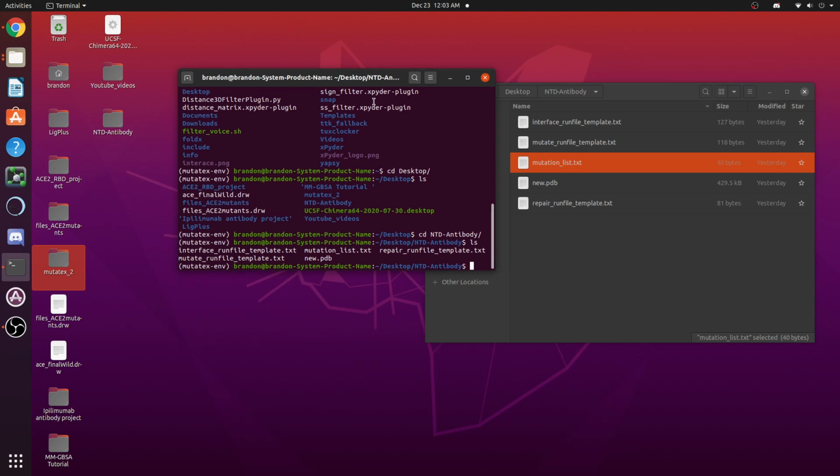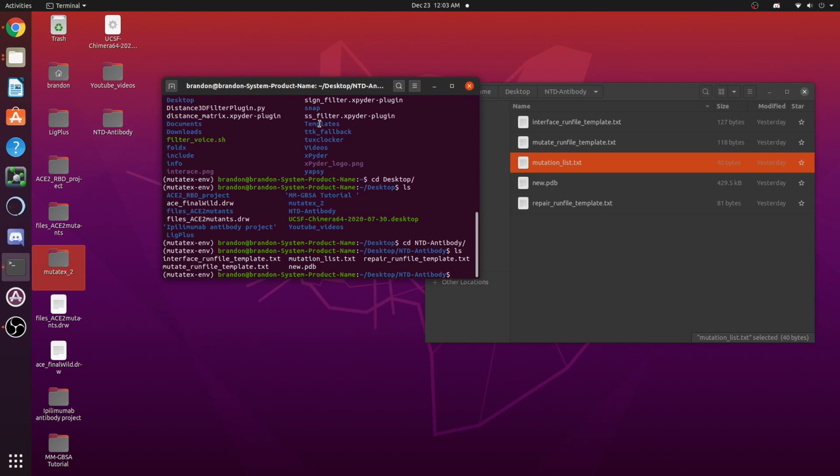So the first thing that MutateX is going to do is it's going to repair your PDB file. This will use the FoldX RepairPDB module, which optimizes the conformation of your crystal structure. It repairs residues with bad energies, with unfavorable torsion angles, van der Waals clashes, and total energy. Your ASN, GLN, histidine residues are flipped 180 degrees. This is done in order to prevent incorrect rotamer assignment. And then residues with bad energies are identified by the software, and they're mutated to themselves along with their neighbors to explore different rotamer combinations to find the new energy minimum.